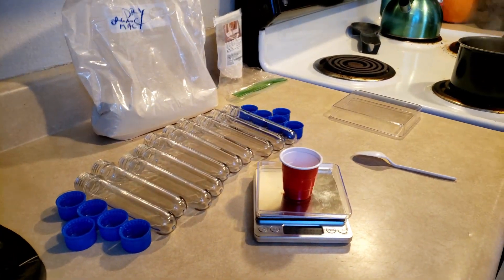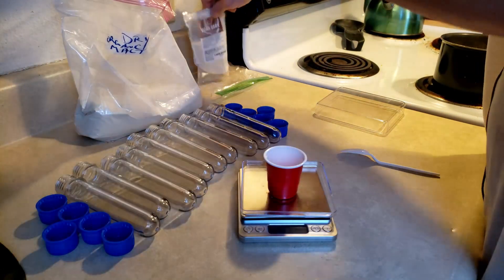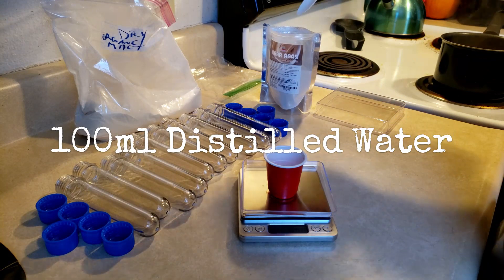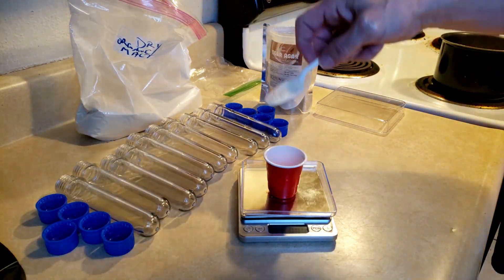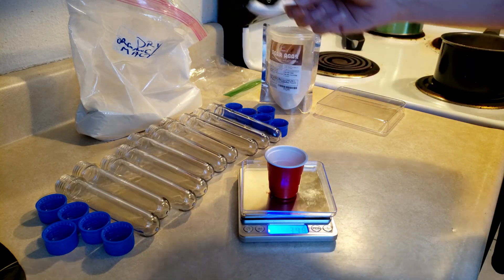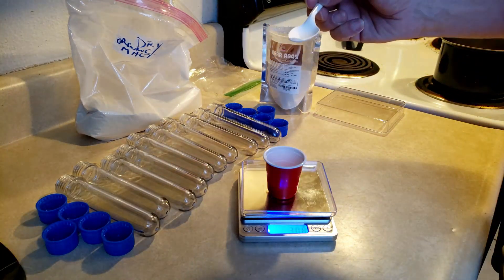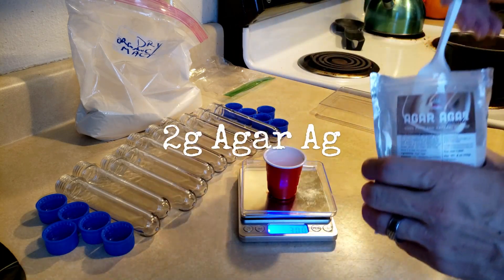While that's happening, we're going to go ahead and measure out our malt and agar mix. It's just going to be 5 grams today total, because we're only using 100 milliliters of water to make our slants. We're going to need 3 grams of malt and 2 grams of agar.